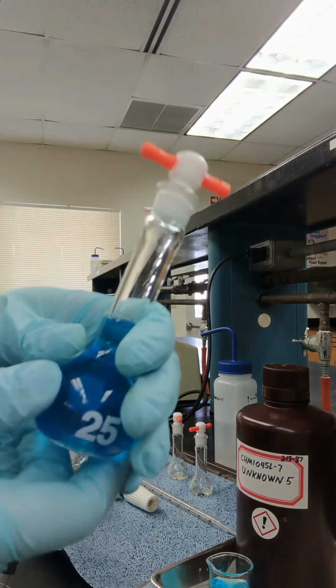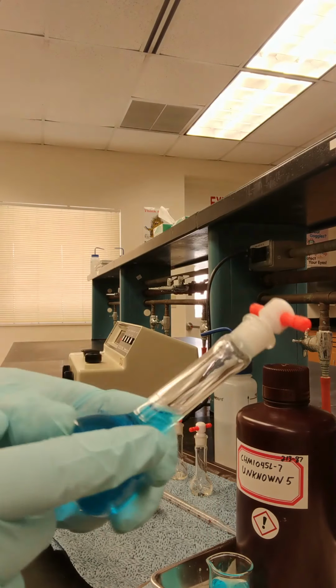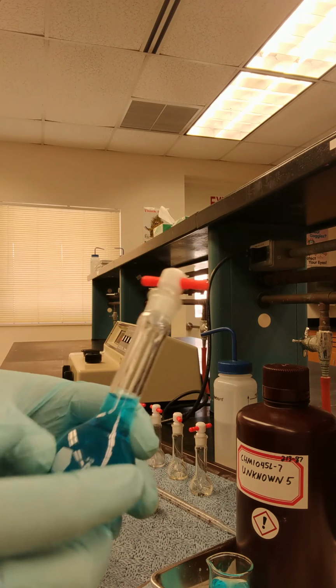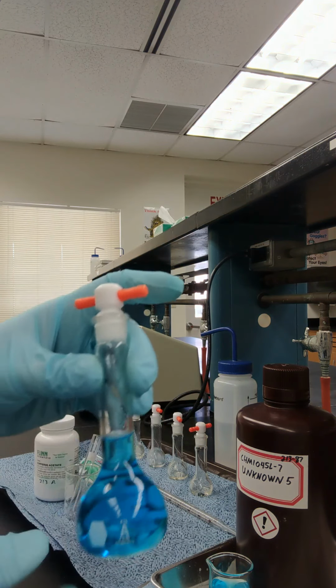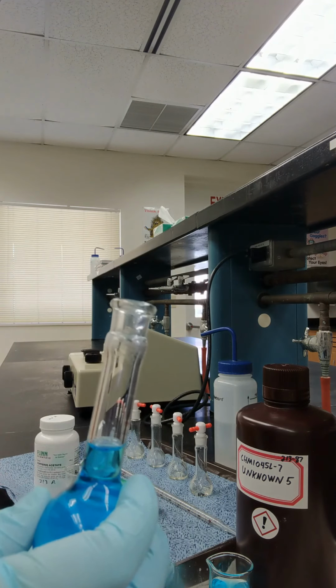So I have here my stock solution, all of the solid dissolved, and now I'm in the process of completing the volume all the way to the calibration line in the volumetric flask. I have a small beaker here with distilled water and a dropper, and I'm going to use the dropper to make sure that I don't pass that line when adding the water.